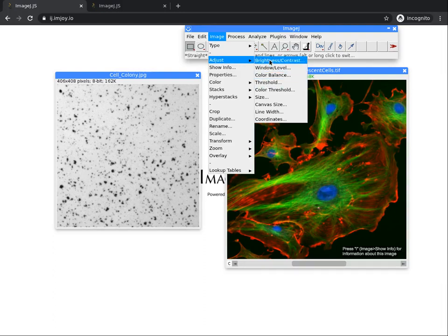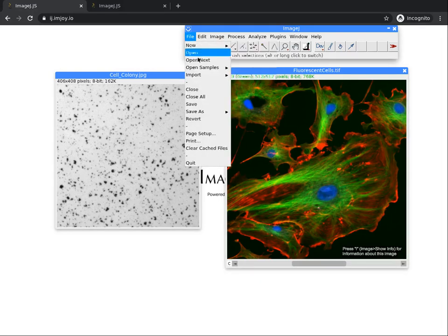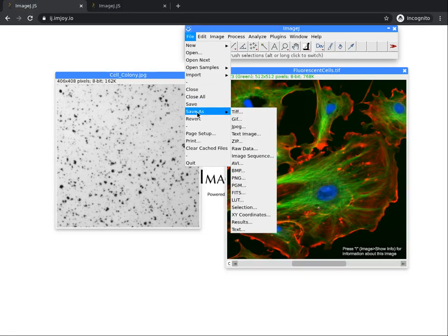You can discover them and go through the menu one by one to modify your image, but I assure you that already modifying the contrast and the brightness is the most important for the following steps. It is always preferable after each change to save your image on your computer, but I advise you to save this image as a new file and not to overwrite the original file. To do so, go to File and choose Save As. You can then select the format of your image and after you can select where you want to save it.